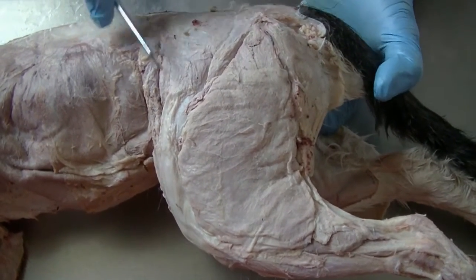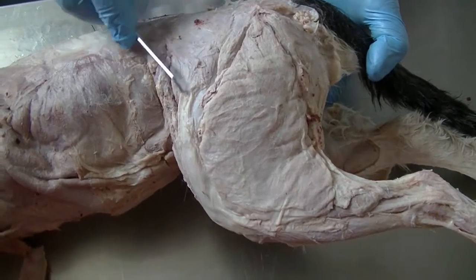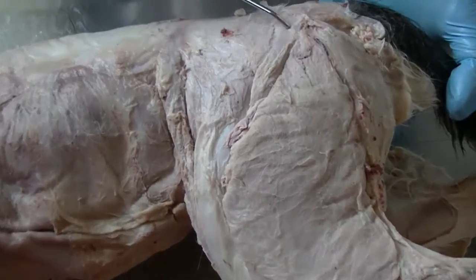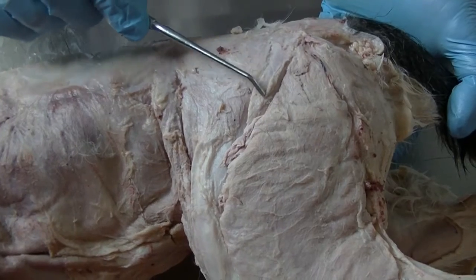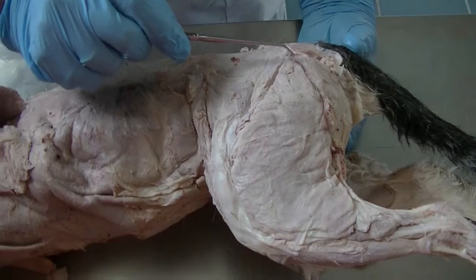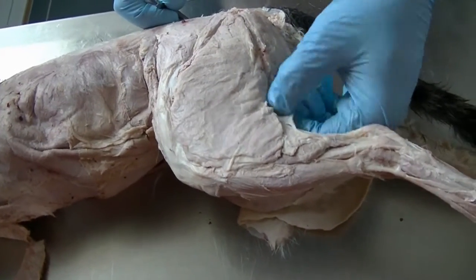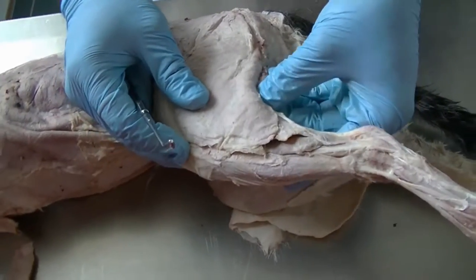Just to indicate what muscles we see from this view: the middle gluteal muscle, the tensor fascia lata, the sartorius. This is an additional muscle which is present in the cat which we didn't see in the dog. That is your cranial crural abductor, which is also called gluteofemoralis. Then we have the biceps femoris muscle. Then we have the semitendinosus as usual, and then we can palpate the lymph node which is located in the popliteal region. That is your popliteal lymph node and other structures.